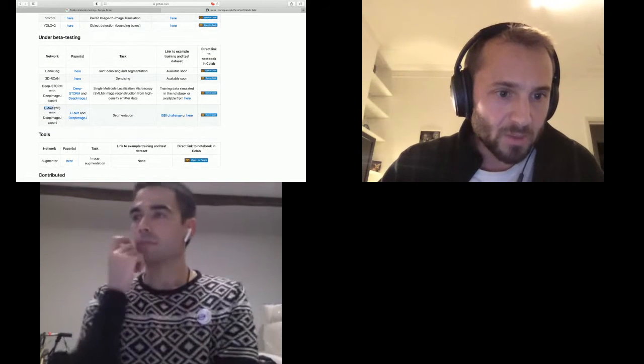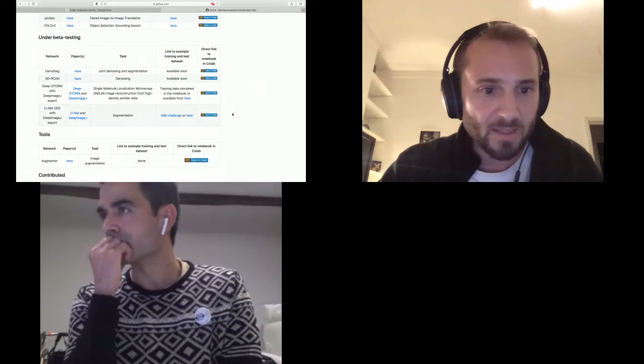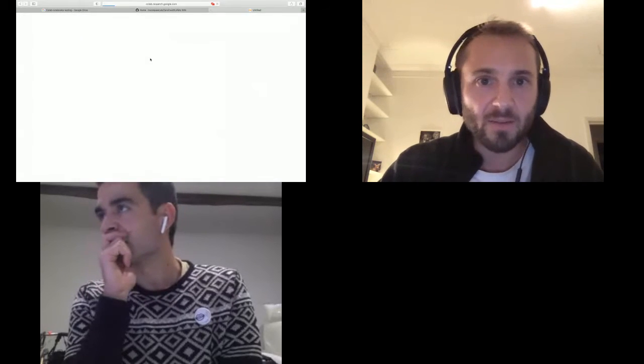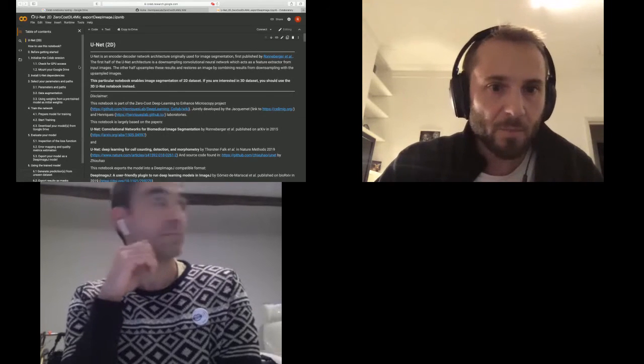I'll be demonstrating how easy we've tried to make those by doing a live demo. What we'll be doing today is a simple segmentation of an electron microscopy dataset using a UNet type of network. I'll open a notebook directly from the GitHub website, and Google Colab is going to load this up for us. There you go.